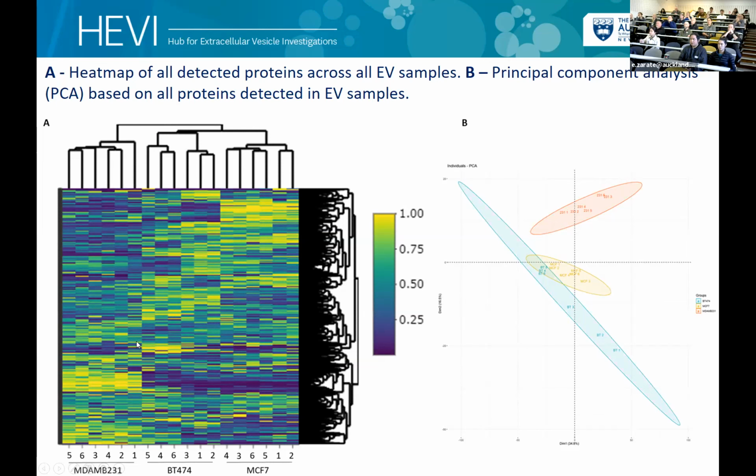Here we started wondering if there is a set of proteins that are present consistently across all our samples and not changing over the lifetime of the bioreactor. And another important question we asked: are there proteins that are changing over time, and may this feeding cycle affect them?